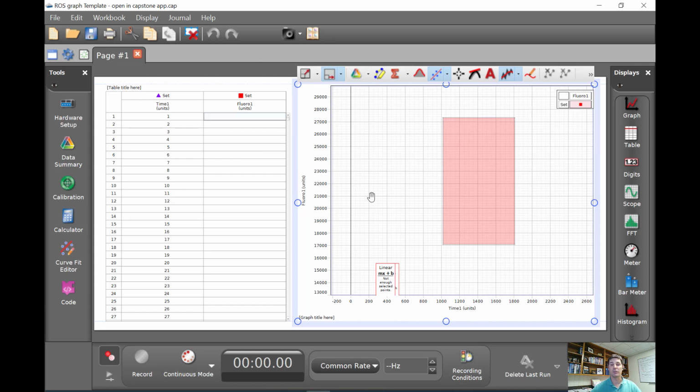Again, relatively straightforward there. I'm going to pause the video, and we'll come back and I'll show you some data samples that aren't so obvious, where we can't just take the big red box, put it around it, and get a slope immediately, and we actually have to delete some points. So let me find a good data set that shows that, and we'll be right back.